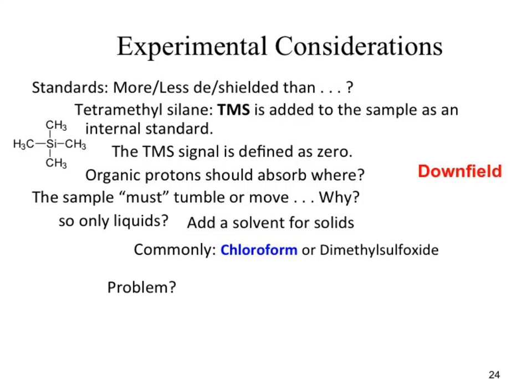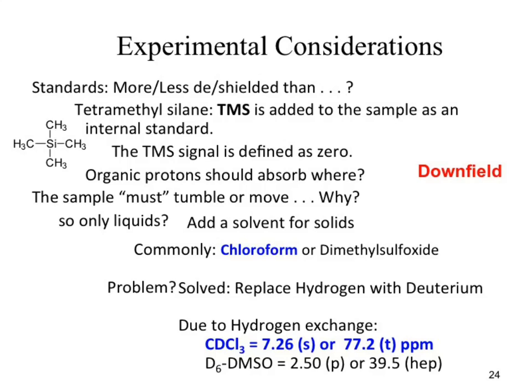A neutron. That additional neutron changes the magnetic moment. It makes deuterium now invisible to the NMR spectrum. So what we end up using is deuterated solvents. So you may see the term CDCl3, because the formula for chloroform is CHCl3, but we don't want hydrogen. So we put in a deuterium. Right?